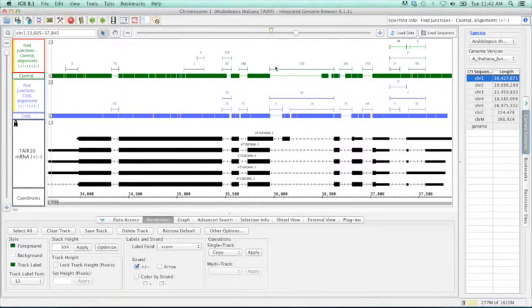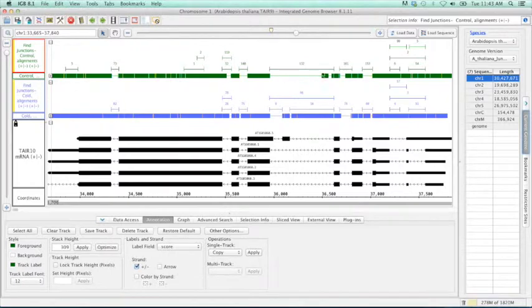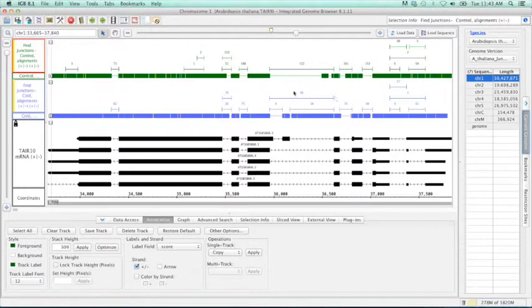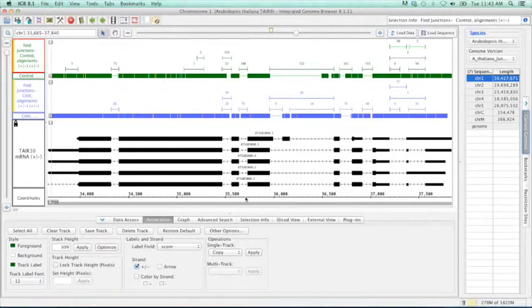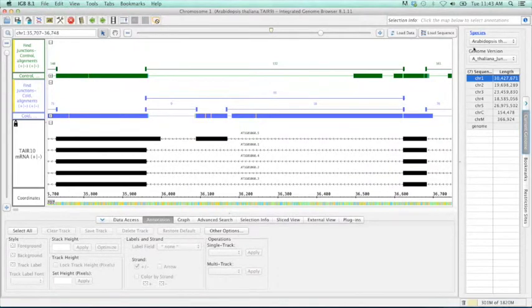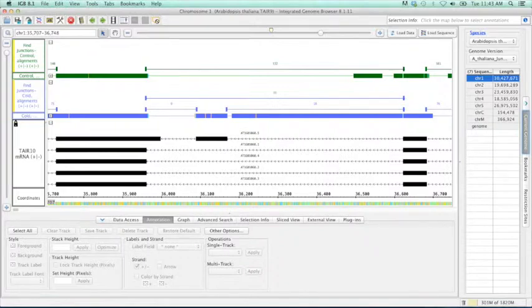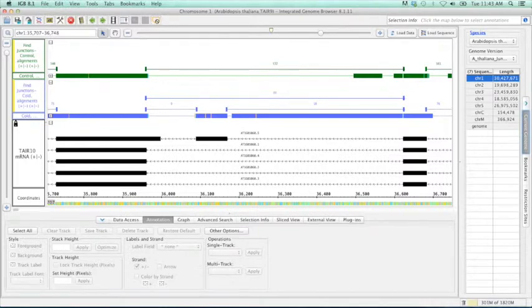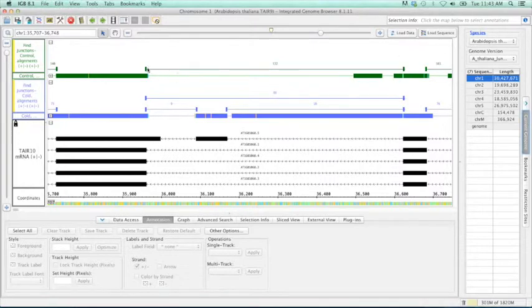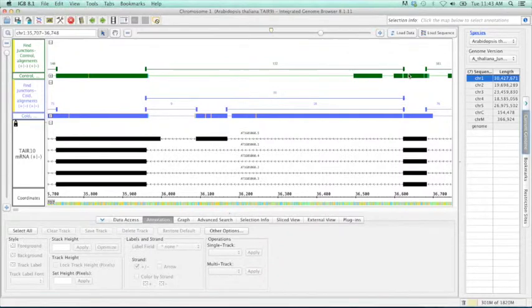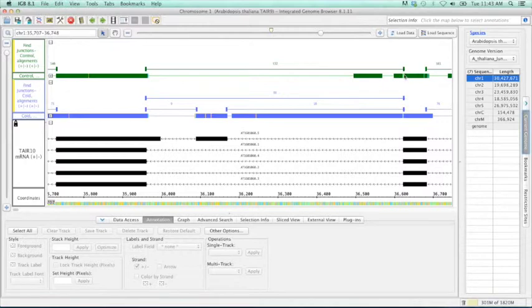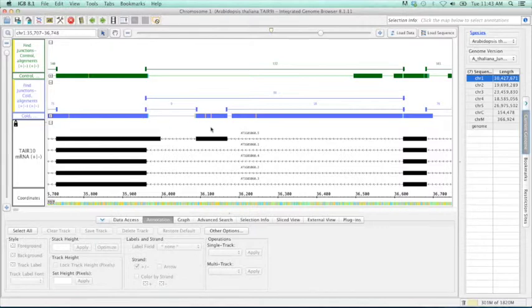We can go through this and quickly tell how many reads are there that support each individual junction. This is kind of an interesting example right here. Here we can see in our control we have 132 reads which support no exon within this region. Whereas in our experimental we have 86 that support no exon within this region. But then we have 9 and 16 which support this one. So let's zoom in here and take a closer look. What exactly do those numbers refer to?